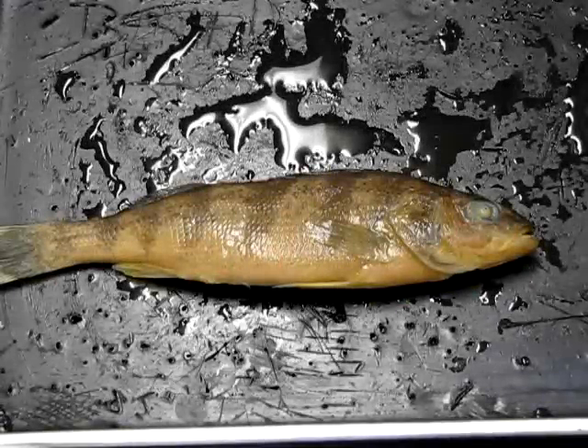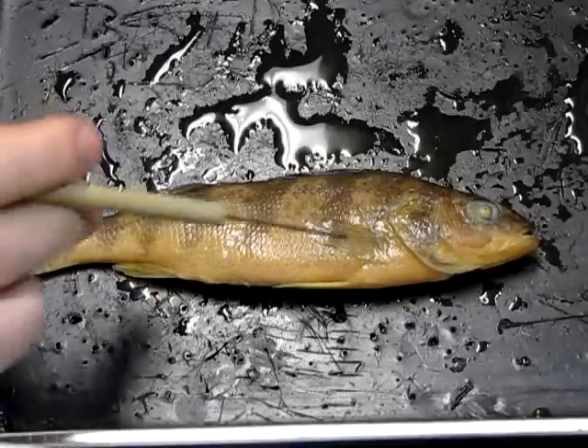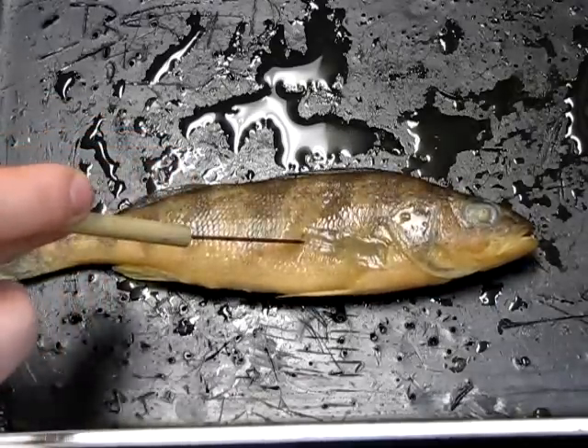This is a perch, a bony fish in the phylum Chordata, subphylum Vertebrata, and the class Actinopterygii. Unlike the shark which had only cartilage, this fish now has proper bones, which we'll see when we get into the dissection.